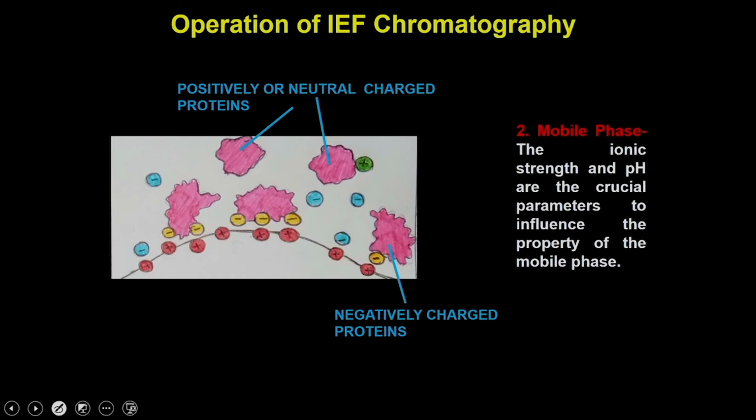So, it is going to show affinity only for the negatively charged proteins, and that is how the protein is going to bind to the ion exchange matrix.